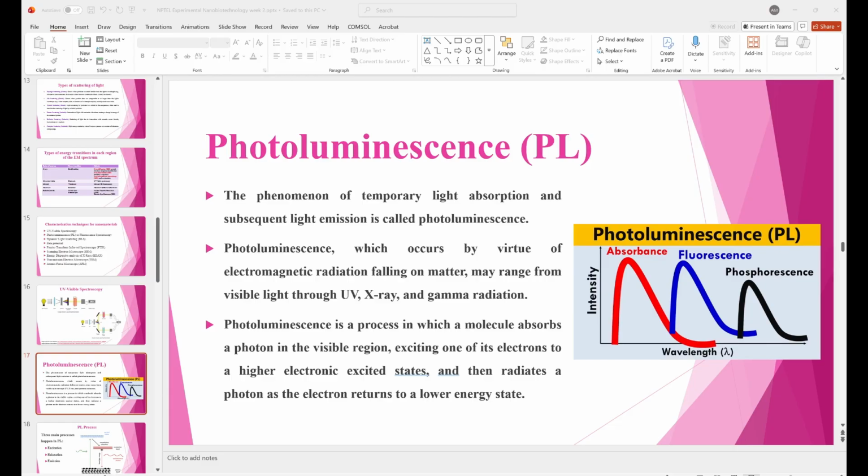So this Stokes shift will happen, and you should avoid any interference from your excitation spectrum. For that, when you're performing PL measurement, you know your absorption maxima, suppose it is at maybe 520 nanometer, for example.